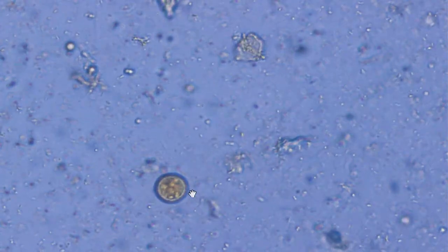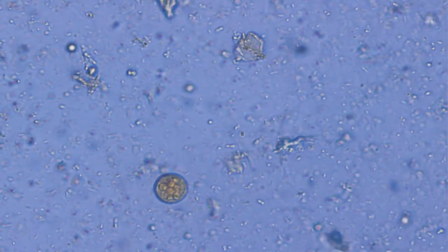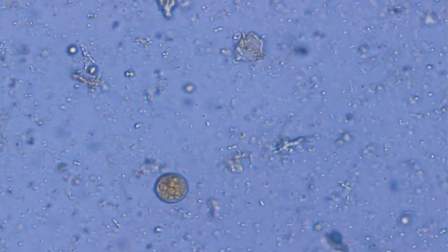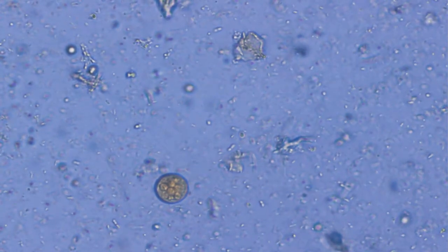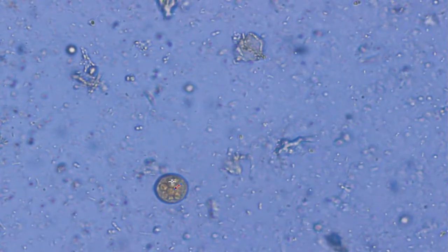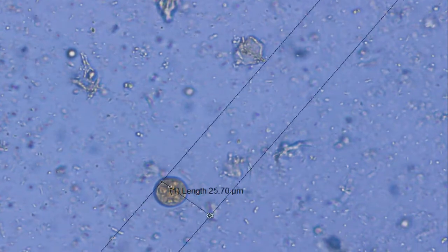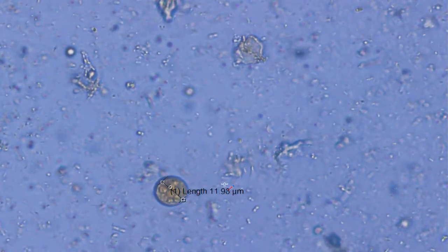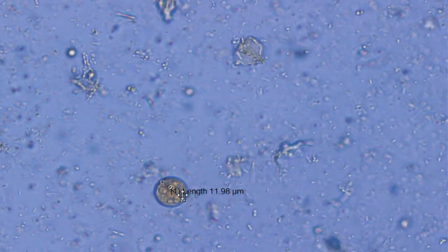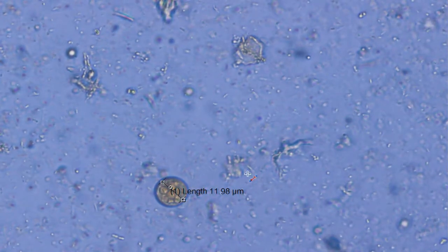This is a much smaller cyst with 4 nuclei. Now, I'm not going to go into too much detail. Well, I will actually. I'll go into detail on what this is now. What I want to do now is measure it. The most important thing for me now is to know the size of what I'm dealing with. So let's measure this and just see. So this is 12 micrometers, which puts it just within the size for Entamoeba histolytica. It has 4 nuclei. You probably can't see very well here.